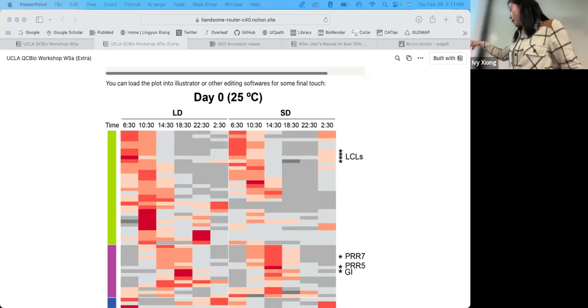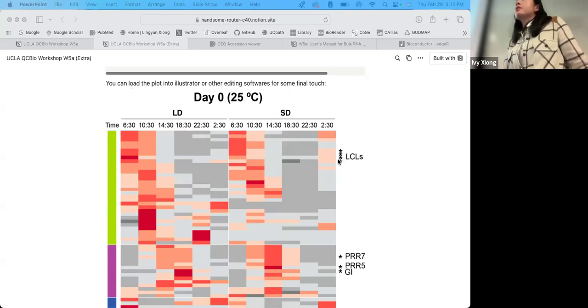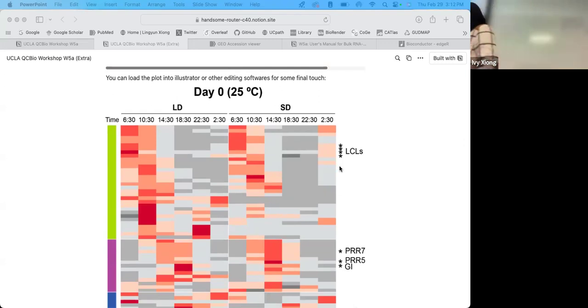and then highlight the genes of interest. And then maybe you want to add additional lines, kind of a partition so that it's easier to see the two conditions. So this is more the aesthetics, so that it will make it easier for readers to make out the message. Have you added significance here? Or like the stars? Oh, the stars are more for highlighting the genes that I want to showcase. No, there's no stats done here. Yeah, I can use a cross or any other symbol.